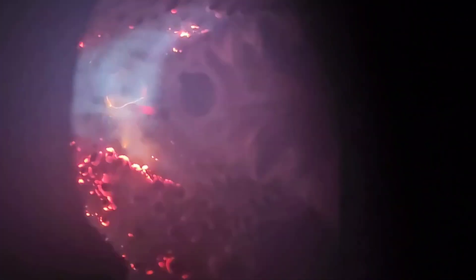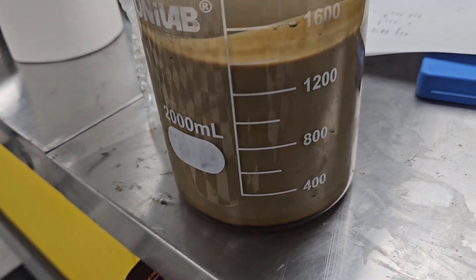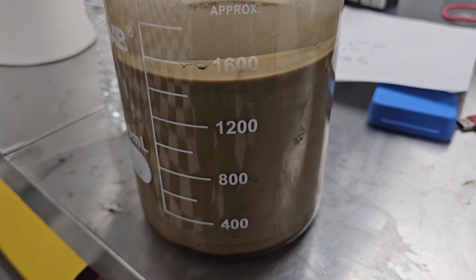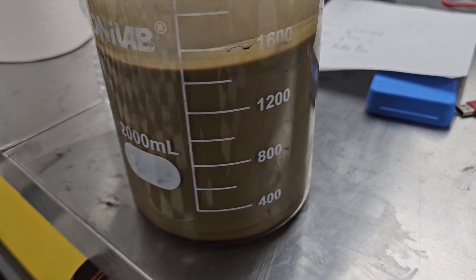She's chooching! That's the kind of chooch we need. See the flame rod glowing red in there — that's what I'm talking about. We're cooking with gas. That's how to wind down the day — fix it up, but we got it. One more thing I forgot: we were working on the hydrolysate after it's been filtered. We've got a couple more rounds of filtering to go, and then we'll send it off for analysis.